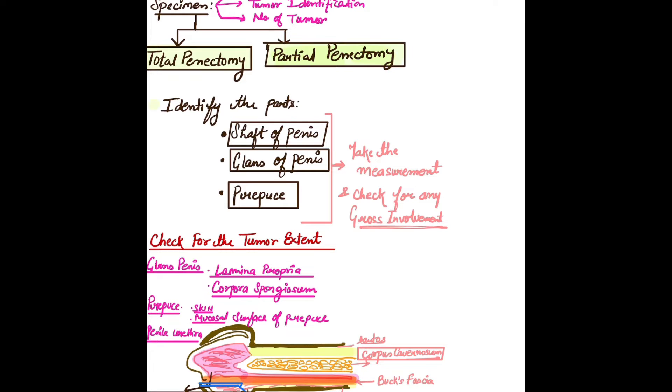We'll take measurements of the whole specimen in all three dimensions. After documenting the measurements, we will identify the tumor and document it as either infiltrative type or proliferative type.